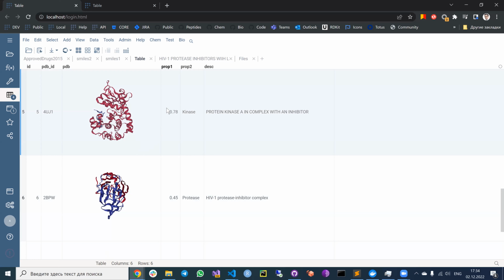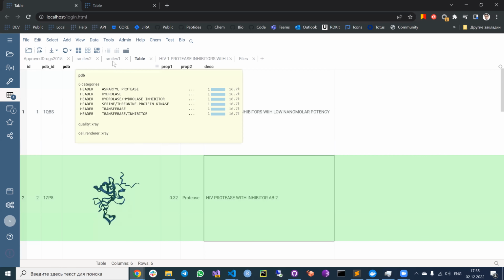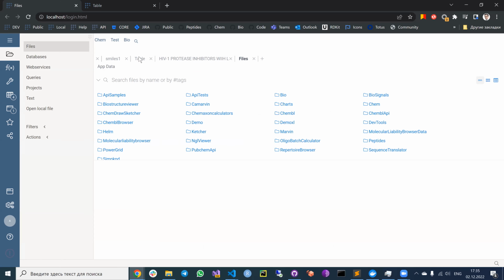Maybe before we proceed, any other questions on file notations or file formats that are going to be supported? So when you import an SD file, which contains multiple chemical structures, how do you deal with the tags? Because each molecule can have a set of tags in the record, do you show the union of all tags, or do you take a sample of the first few molecules and then create columns?